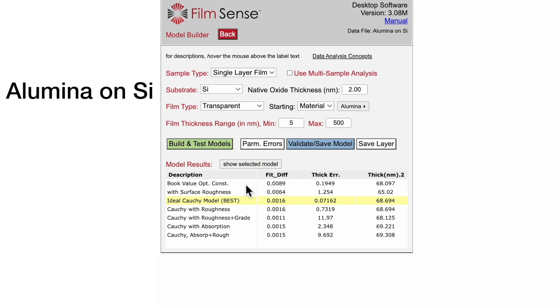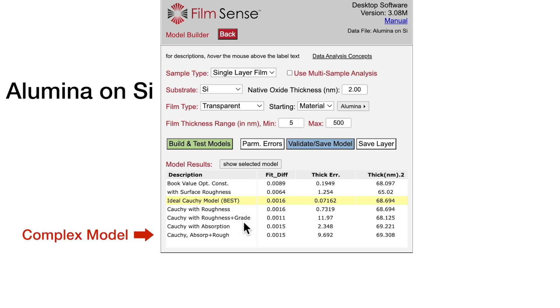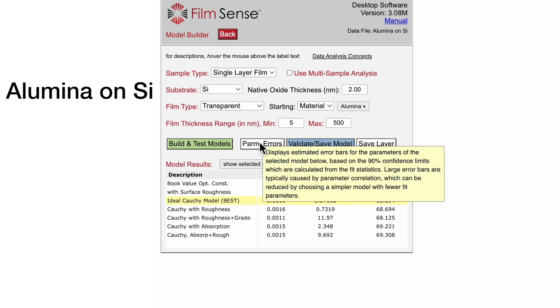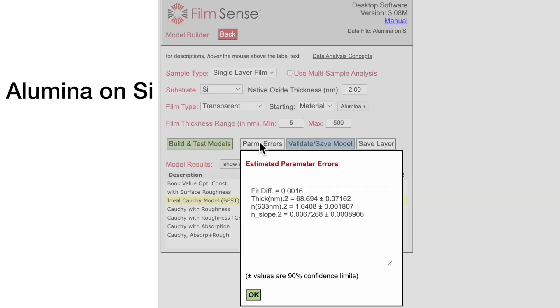The model results are shown in the table, with the simplest model at the top, followed by models of increasing complexity. Click the PARM Errors button to verify that the ellipsometric data provides acceptable sensitivity to the fit parameters in the selected model.